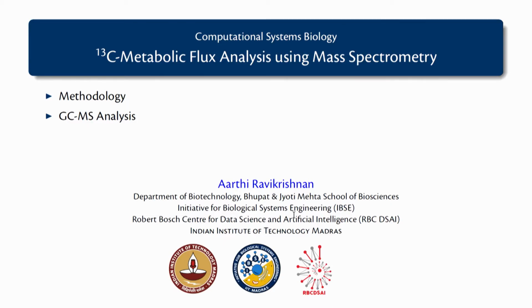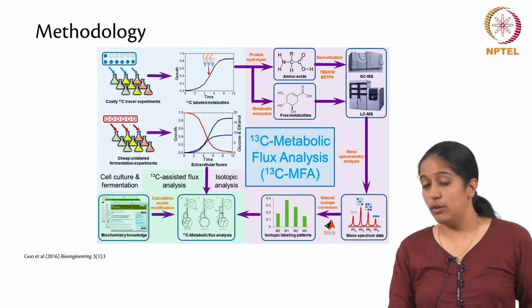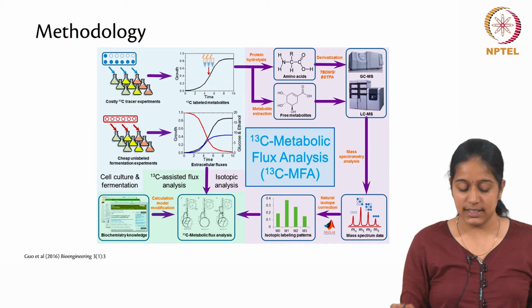In this video we will be looking at the experimental methodologies to carry out metabolic flux analysis, and also look at GCMS data using labeled amino acids to understand how we can carry out 13C flux analysis using mass spectrometry. So, this is the overall methodology for carrying out C13 metabolic flux analysis.